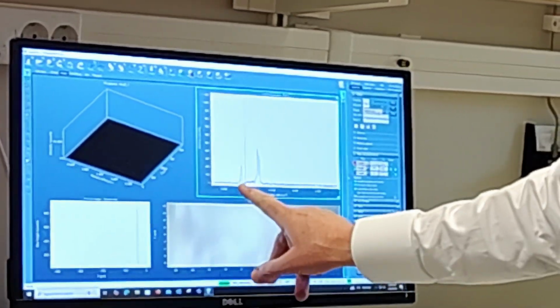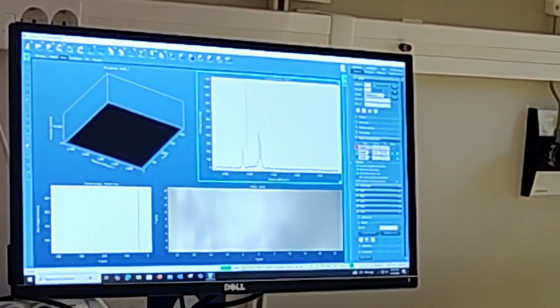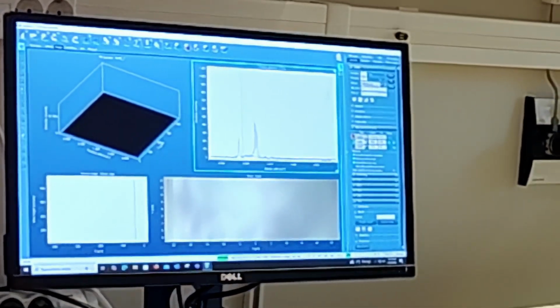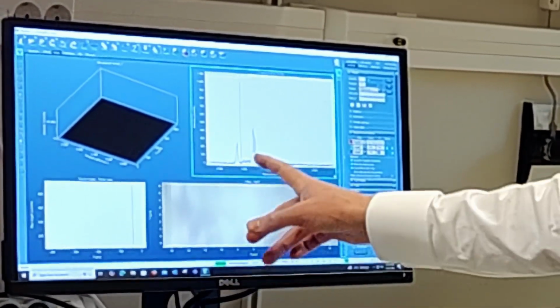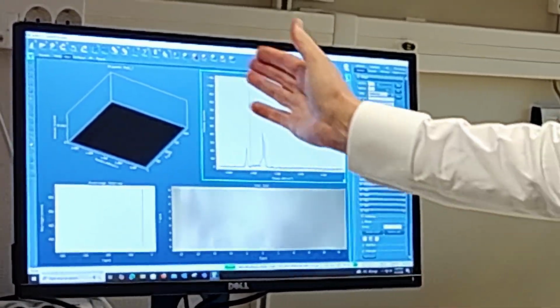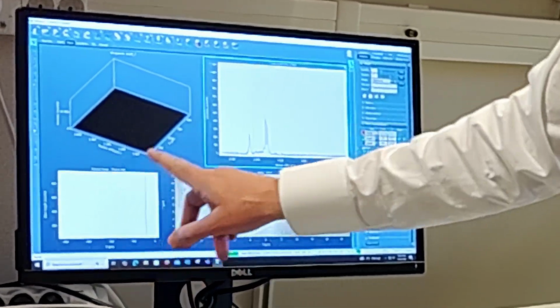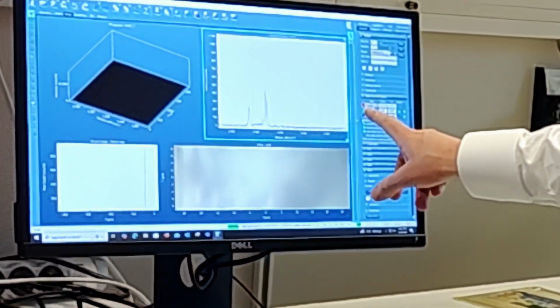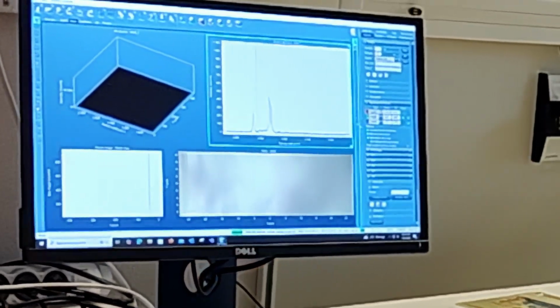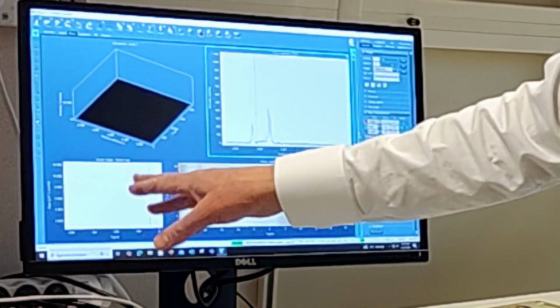Now you see the green marks that peak. And then we can put the blue one on this other one, and what's that? It's like 3,050 to 3,150, something like that. And the red one we don't want to use. So now the green is the height of the peak. That's the count here. We can change it if we want something else. We can choose the area of the peak as well, and this is the area.